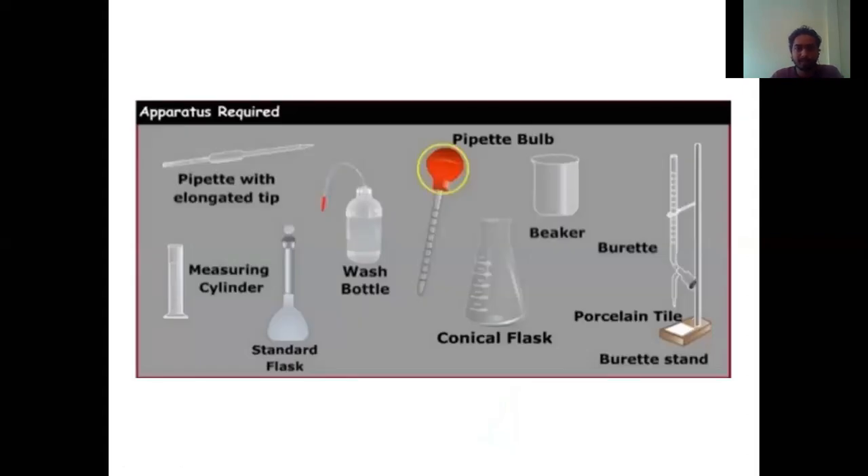These are the apparatus which we are going to use in most of our practicals. I am going to list out some of them — specifically the titration equipment, because in most of the practicals which we are going to perform, we will use titration equipment. First is the pipette with elongated tape. The pipette is used to draw the chemical. Next is this measuring cylinder, which is used to measure the amount of liquid or solution which we have to pick up.